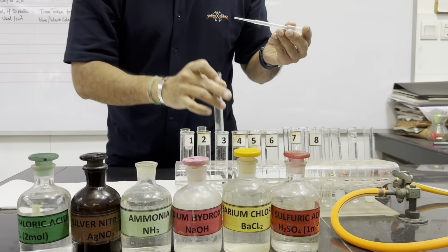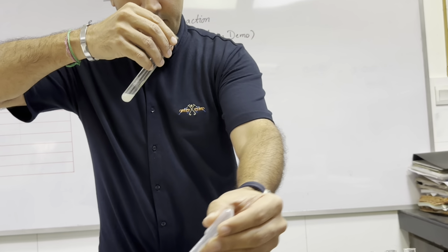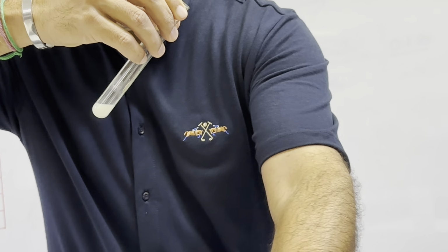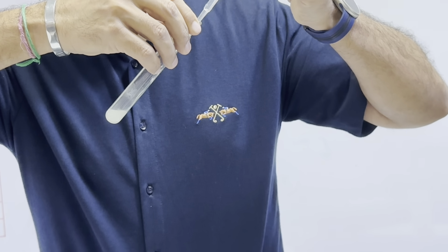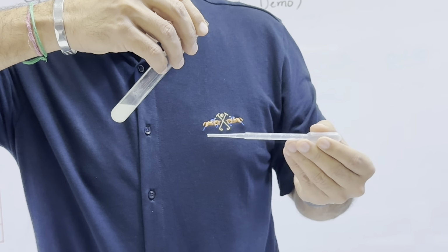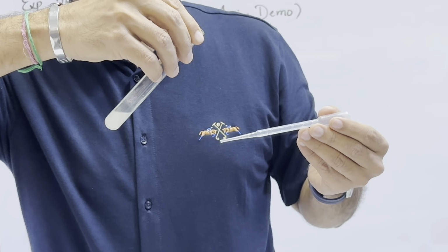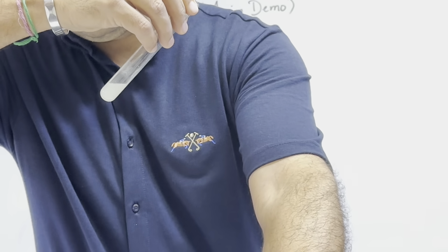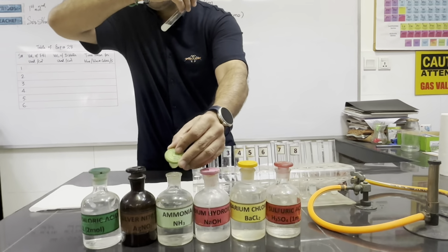While in the case of Fa4, the yellow precipitates which formed at the top layer are not changing at all, which means yellow precipitates with silver nitrate are insoluble in aqueous ammonia, meaning iodide ions are present in this salt.